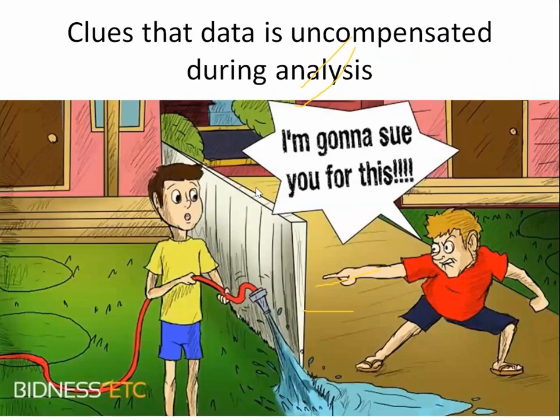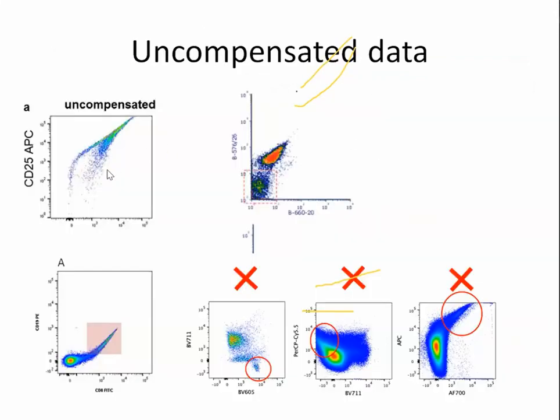So, what are the clues to know? You can ask me, sir, how can I know whether compensation is correctly done or not when I am running a patient sample, when I am doing an analysis? Okay, I'll tell you certain clues.